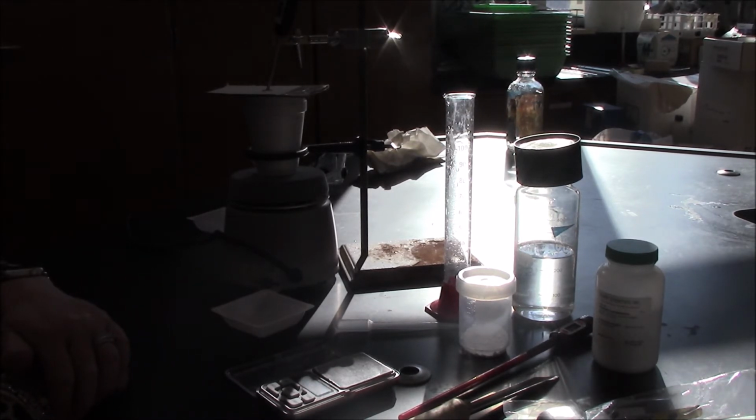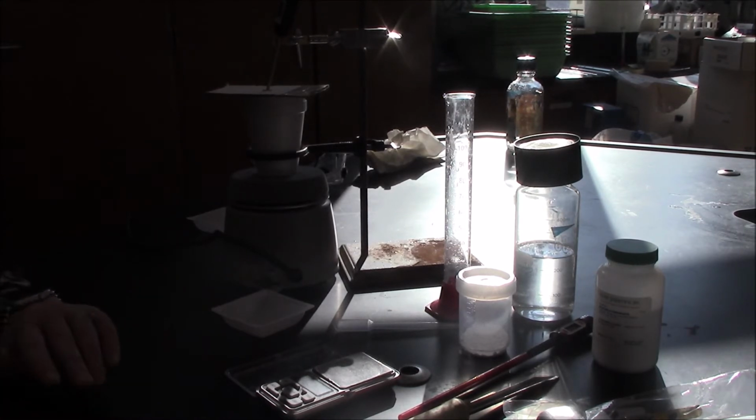Now, the second part of this lab involves calibrating the calorimeter. So, I'm going to stop my video. I'm going to take a moment. I'm going to clean my materials, and then I will return to carry out the calibration part of the instrumentation practice for this investigation.